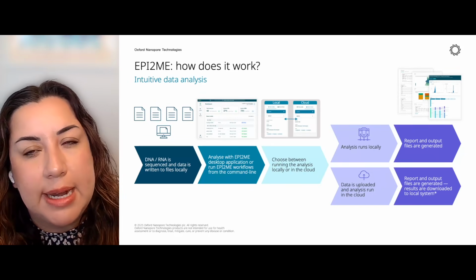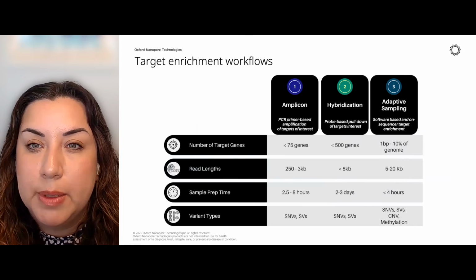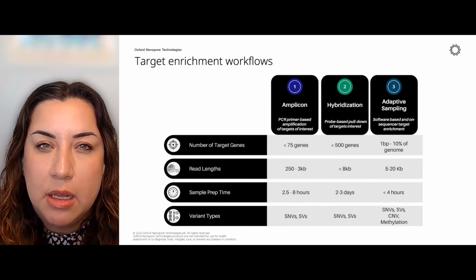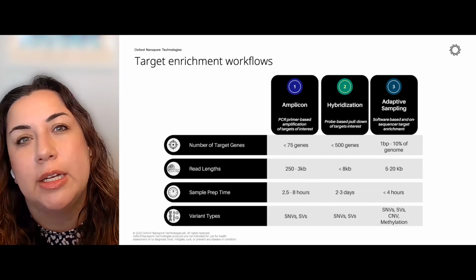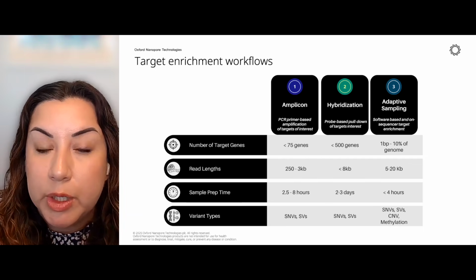And so, really, that's just setting the stage for Nanopore and our capabilities. But we'll be taking a much, much deeper dive into adaptive sampling today, which is a modality for target enrichment. And really, currently on market, there are several target enrichment workflows.